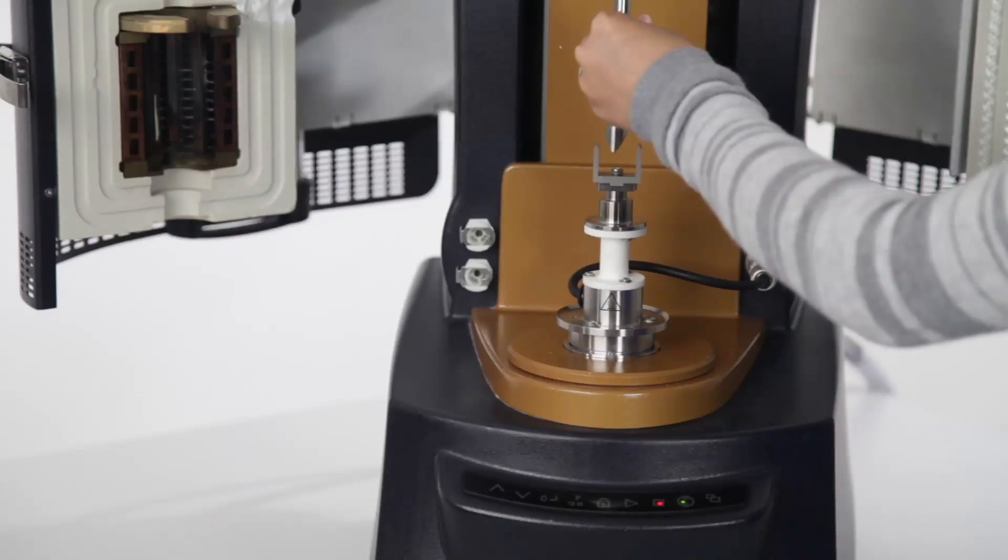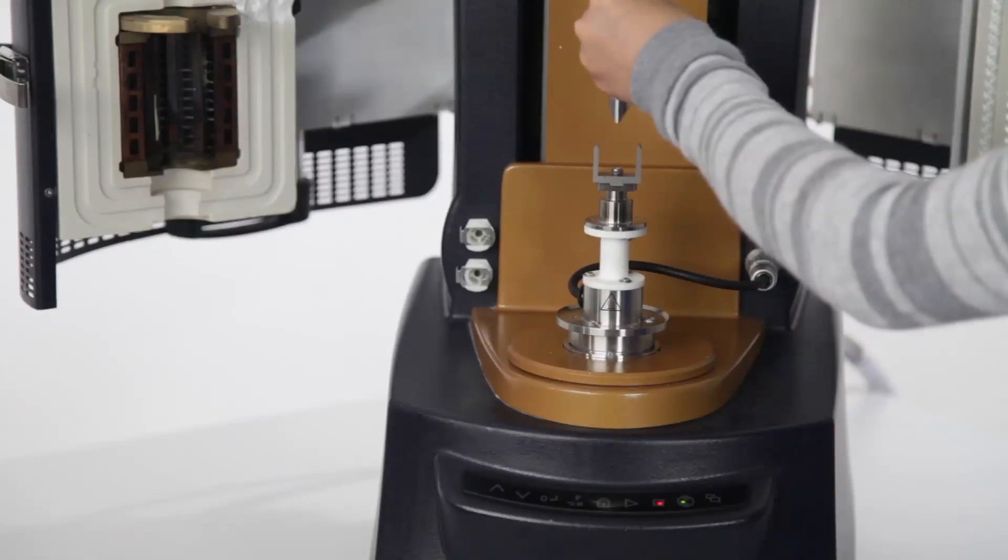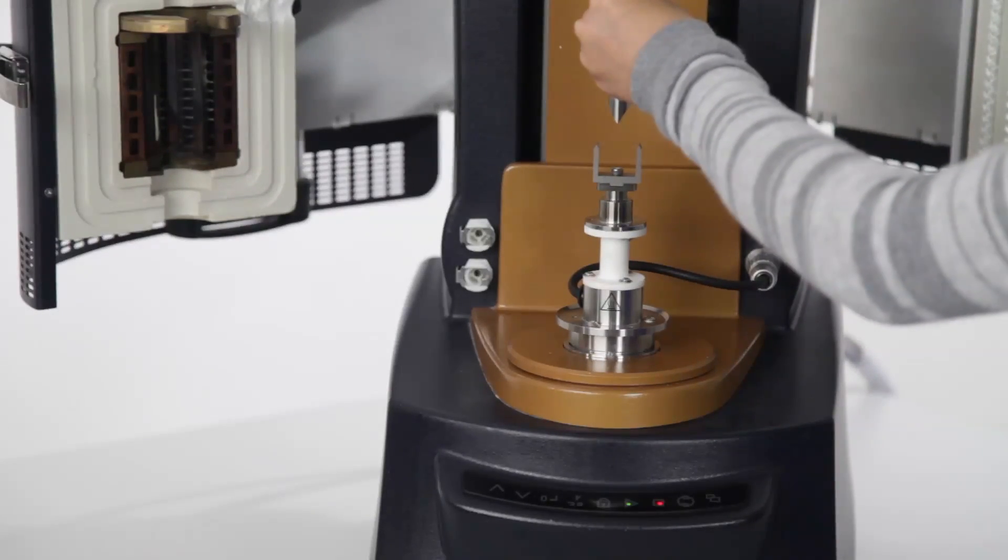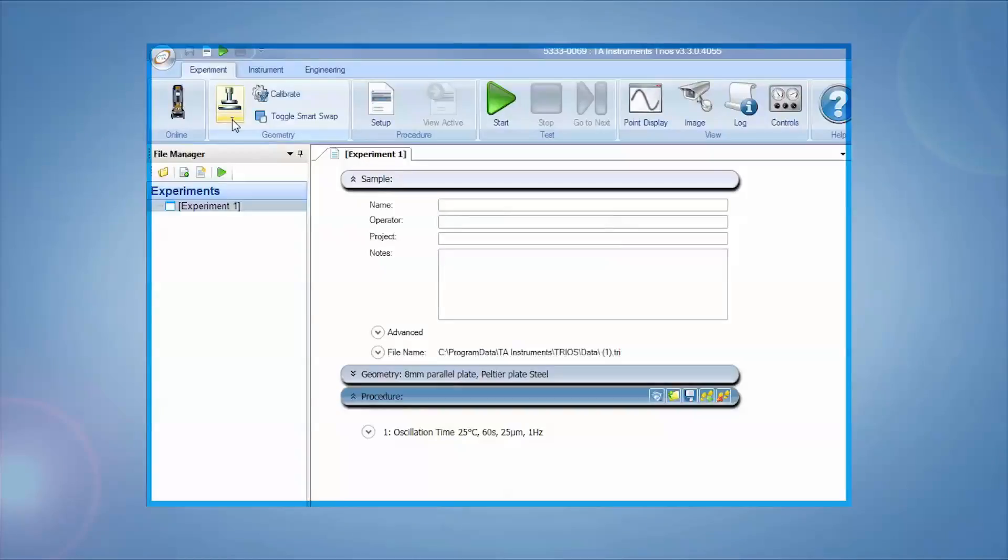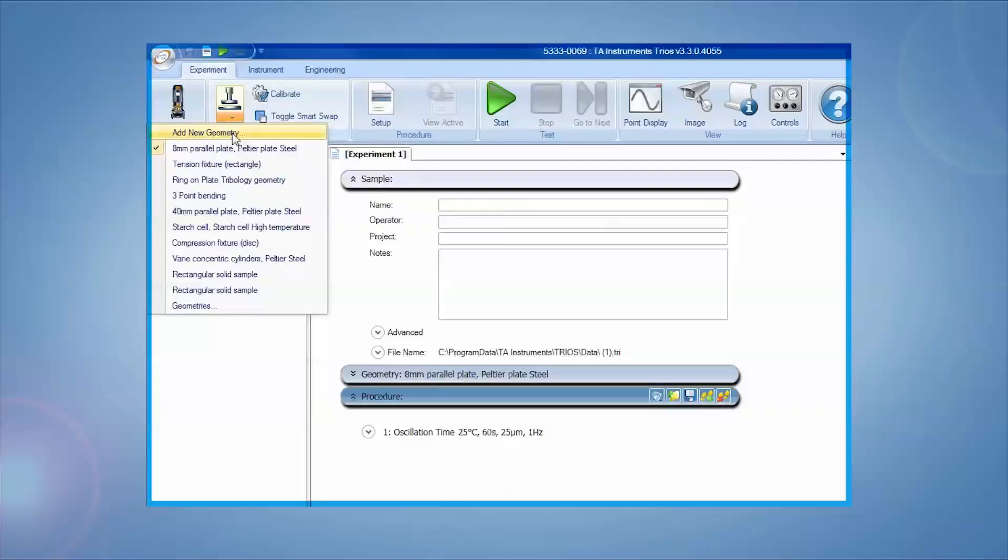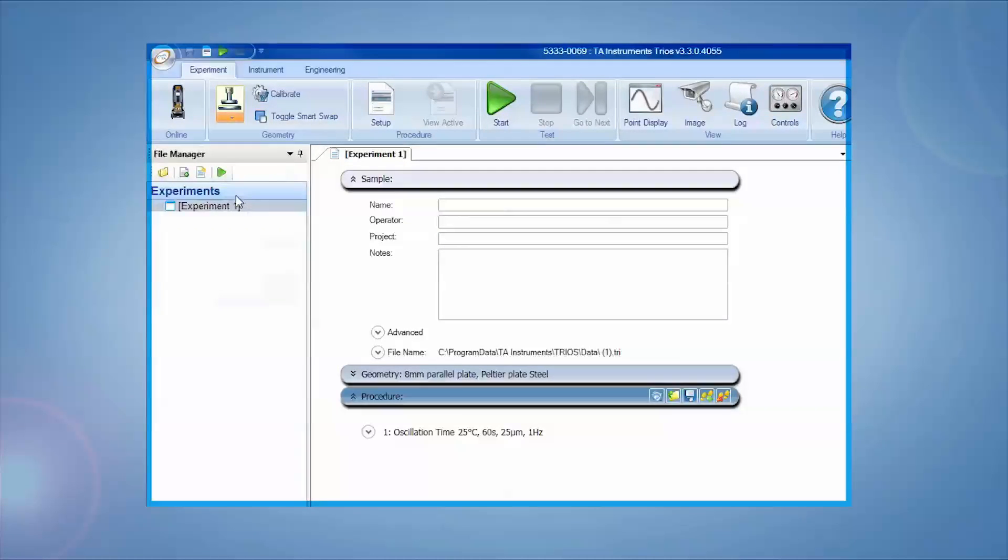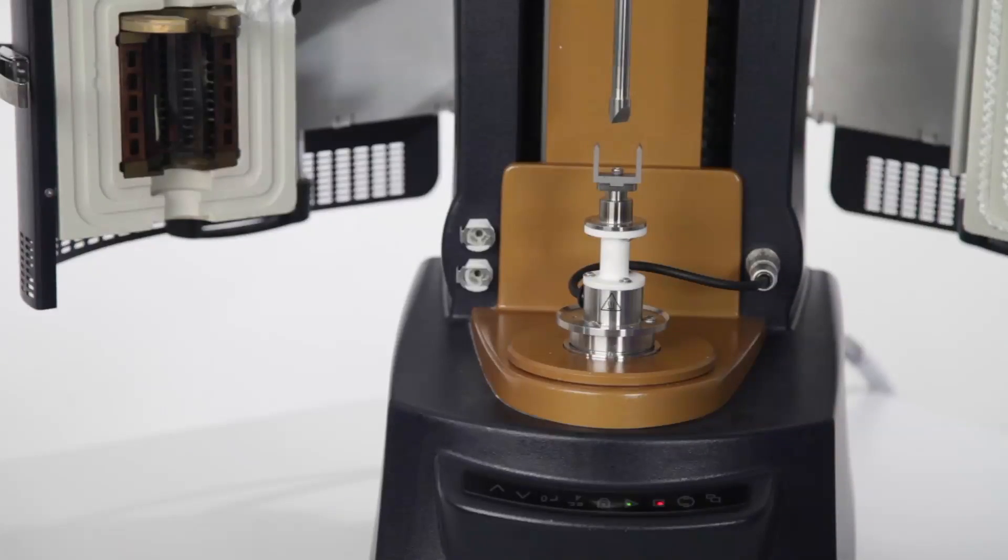Mount the fixtures to the DHR with the 25 millimeter frame and choose the three-point bending geometry from the drop-down menu in the Trios ribbon.